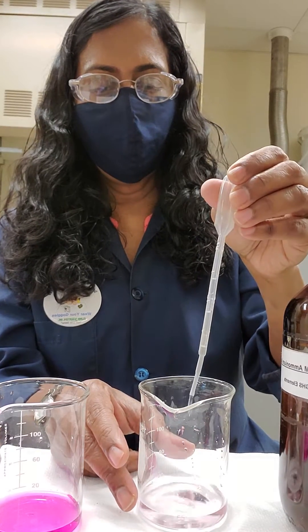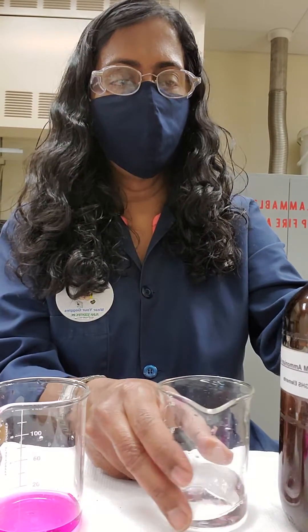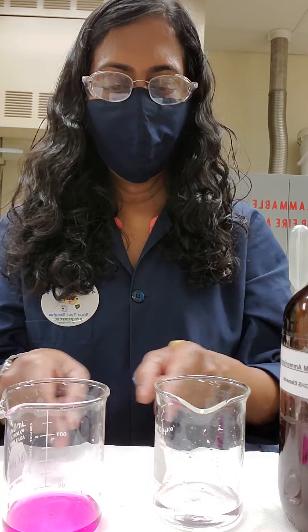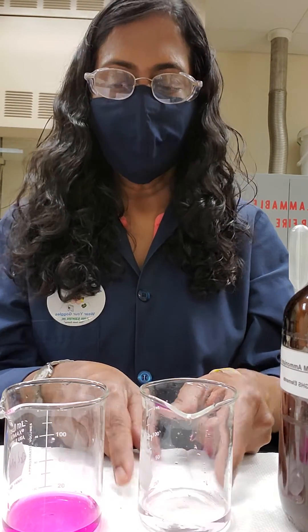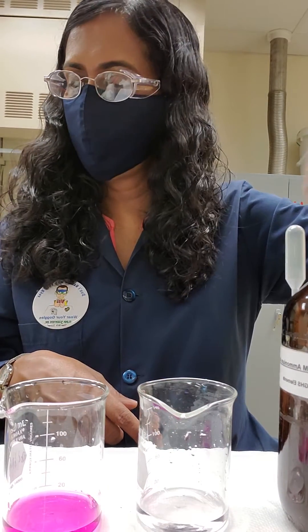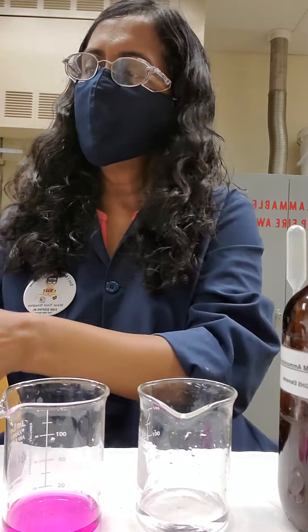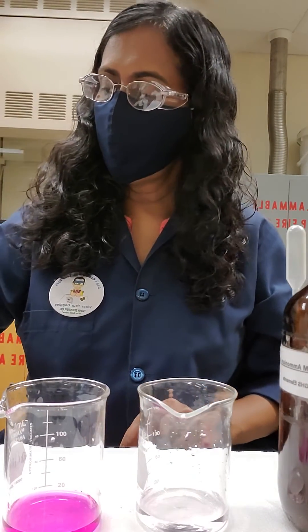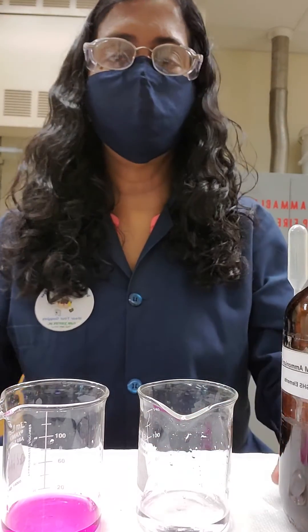Until the color is all gone. This was the initial color, and now the color is all gone. You want to record the new color after adding the ammonium acetate. That is the ammonium hydroxide equilibrium.